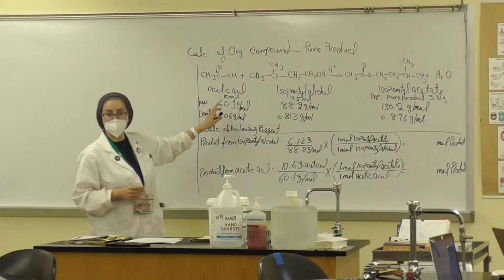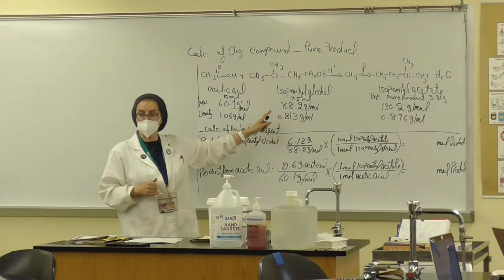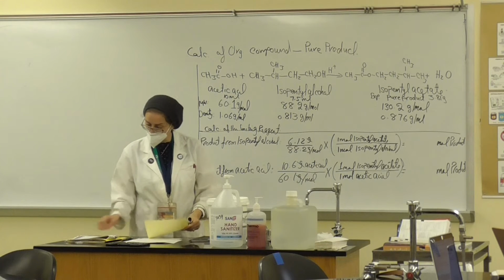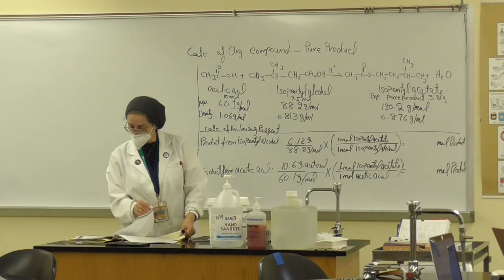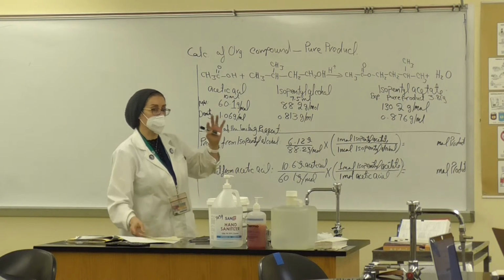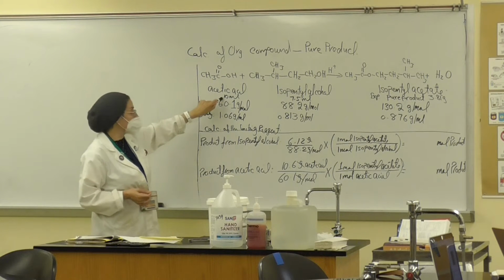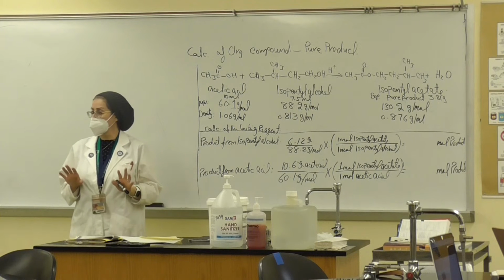We are going to have acetic acid reacted with isopentyl alcohol. I put it together, and it is there for you. They have it in the following page. If you look through page number 611 and forward, you're going to see everything. They gave you a table with the molecular weight, the amount that is required, and also the density, because we're going to need it, okay?